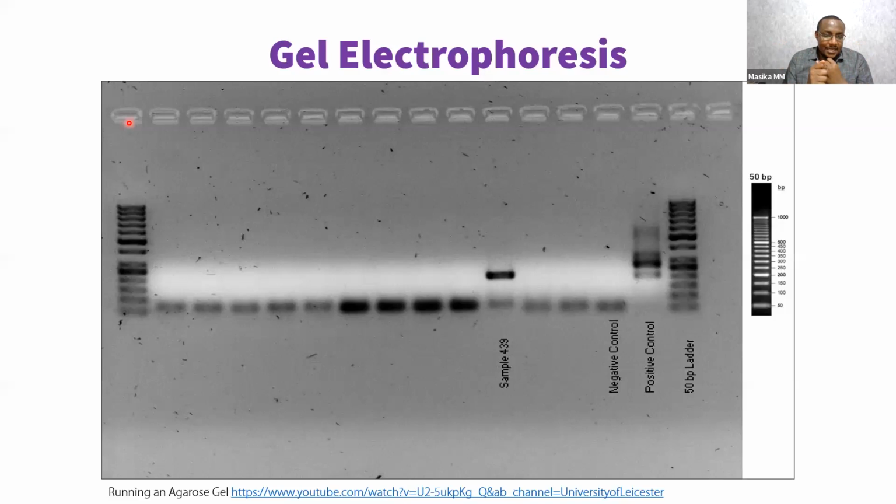One is a dye that we use to visualize, and that dye you saw is either green or yellow or whatever. And you also mix it with something that binds DNA. There are different names. One is called gel red. There's another one called a bromide compound, which sometimes people consider able to cause cancer. It's called ethidium bromide.